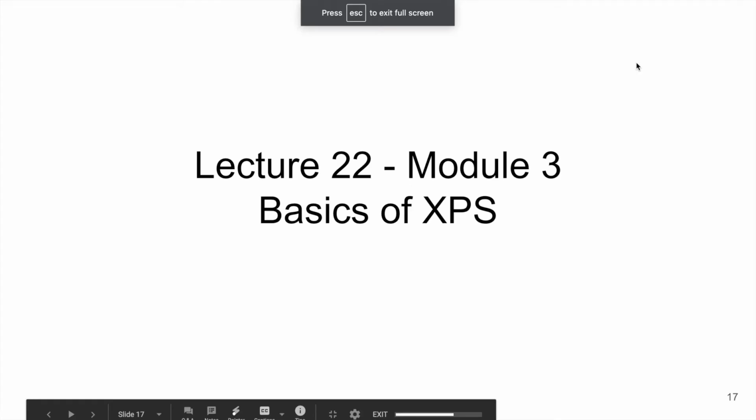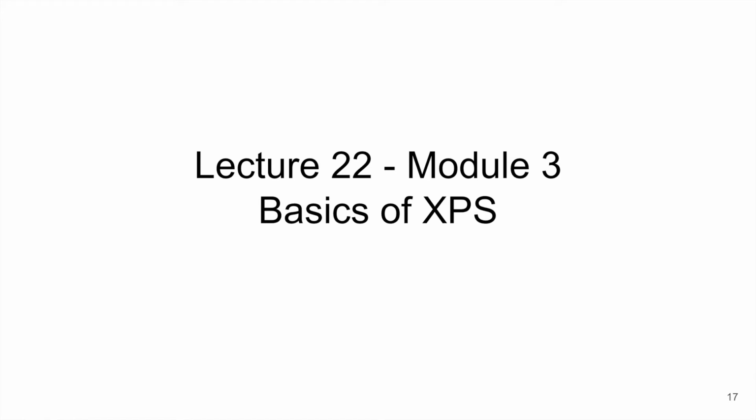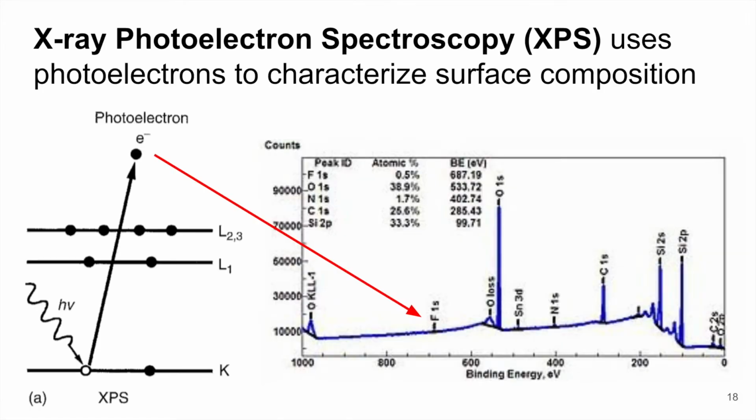All right, so in this next module, we're going to talk about how we use those photoelectrons as the basis for a technique called XPS. XPS stands for X-ray Photoelectron Spectroscopy. So clearly we're going to be talking about those photoelectrons that we just looked at.